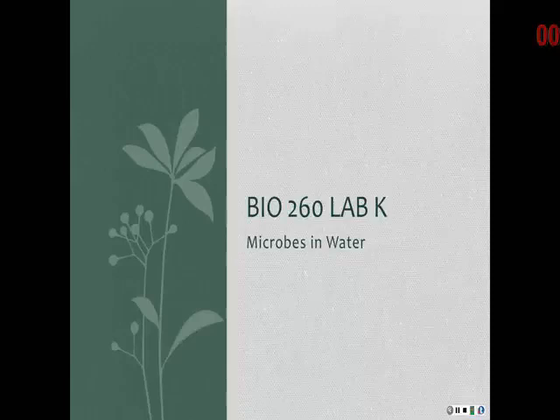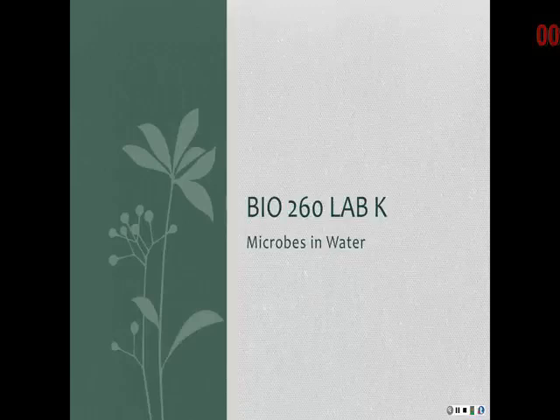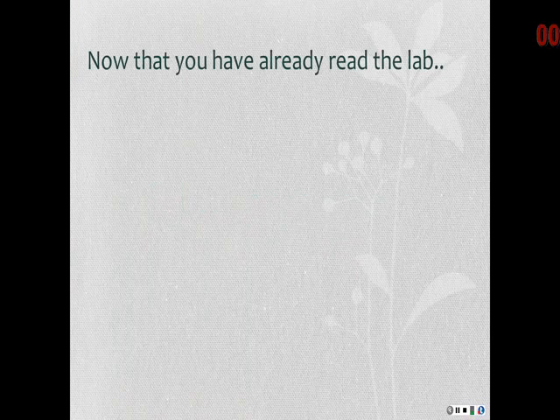portion of the lab for Lab K and water testing, looking at microbes in water. And this is assuming that you have already read through the lab procedure that you can find online. So now that you have read the lab, where might you find contaminated water?